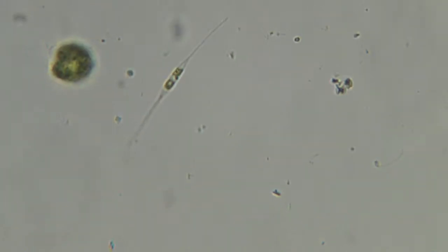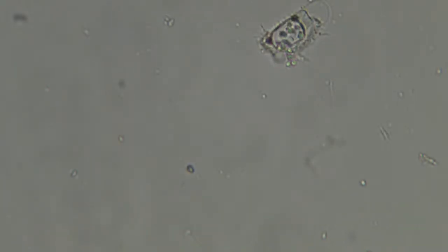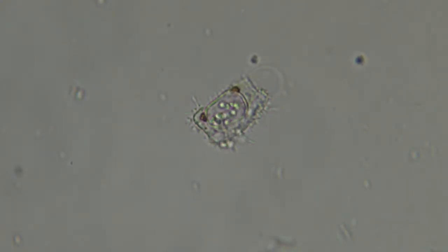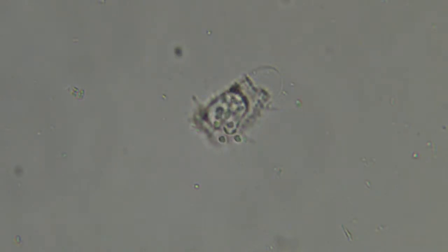Nice little pointy diatom there. Oh, look at that. That's cool. So this diatom looks like it's been perforated and a bunch of chlorella are gathered inside of it. Let me get these centered well because this is off. It's more like that. There we go. There's a party inside there. I think those are chlorella. Certainly look like it. But they're just inside there, bouncing around. Having a little party.